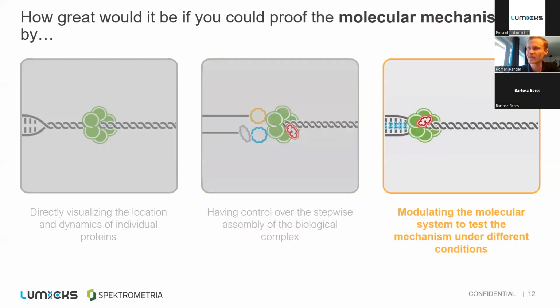The third aspect I would like to talk about is it would be also great to be able to modulate the molecular system internally and also externally. For example, by pulling the DNA and see what, for example, mechanical tension does to your process, or by exposing your complex to different drugs that are supposed to modulate the action of this complex.